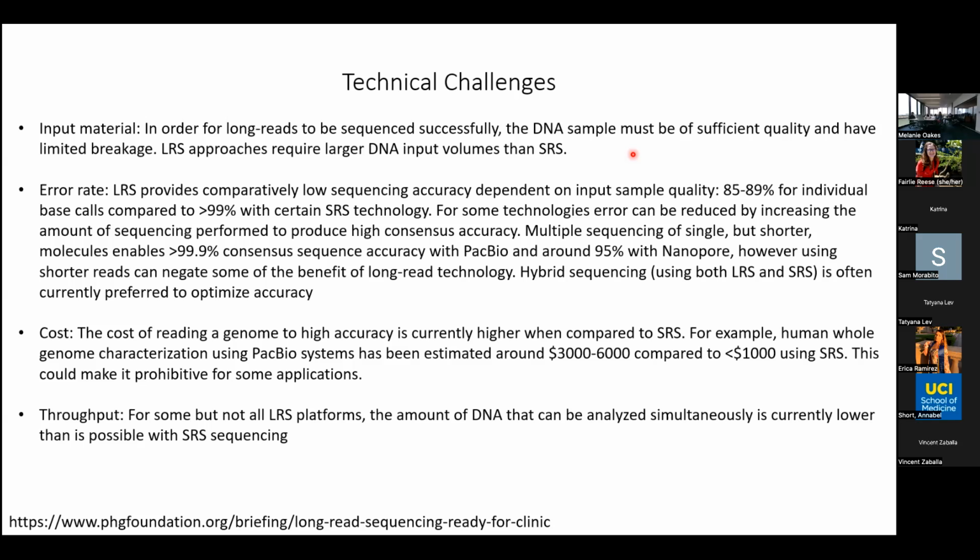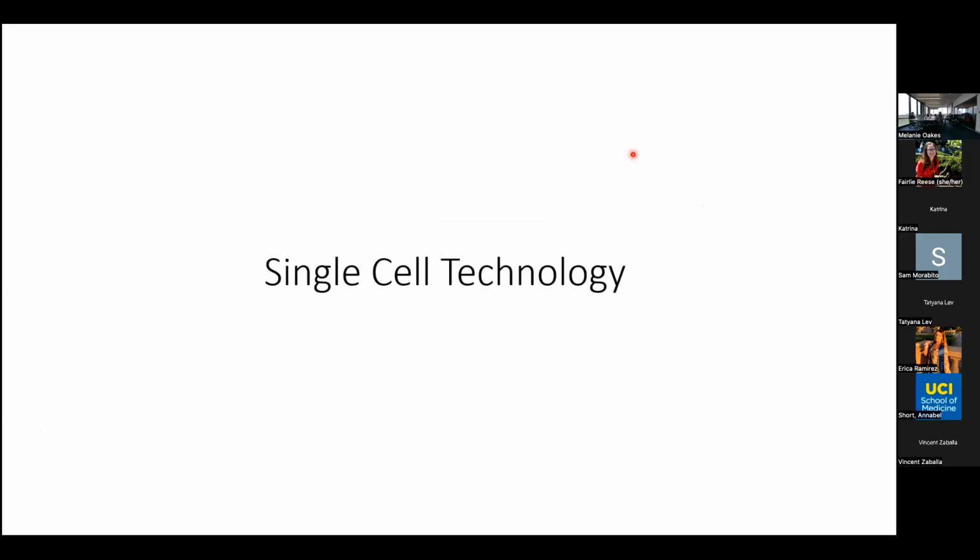It's also a higher cost than Illumina, and its competitor would be nanopore. That would be using either a MinION or the GridION or something like that. Do you guys have a MinION or anything? We have a MinION, but you're not allowed to offer MinION as a core service.